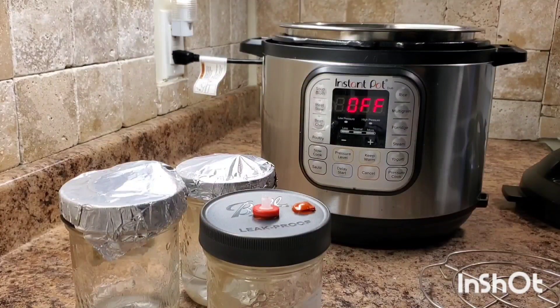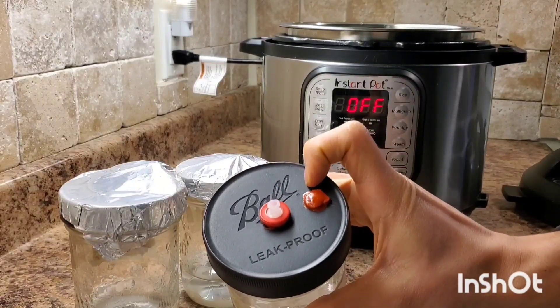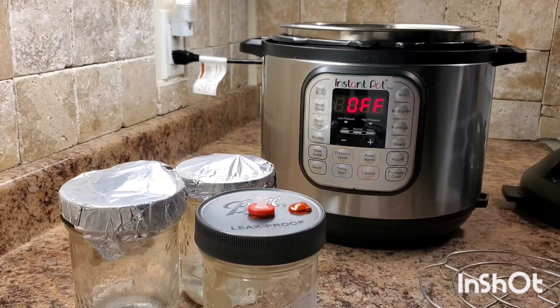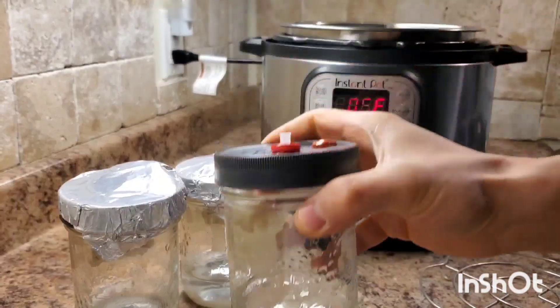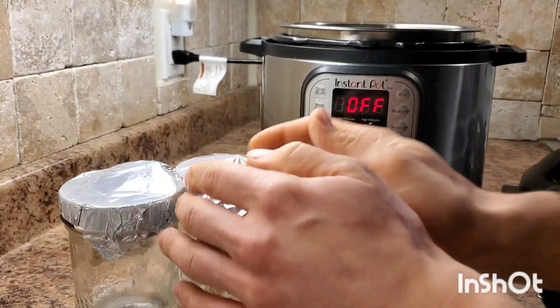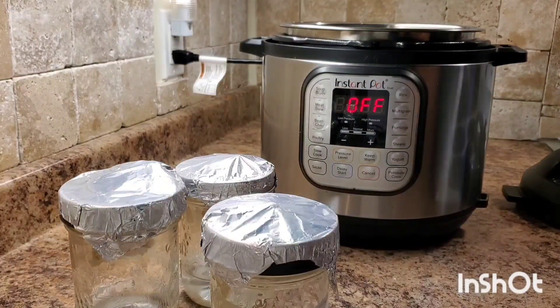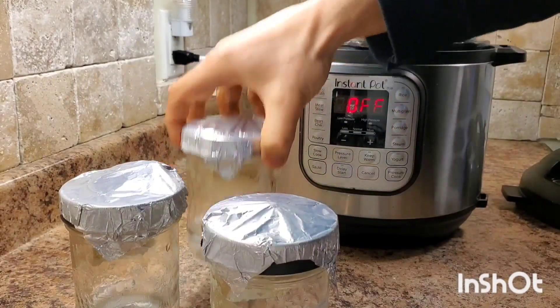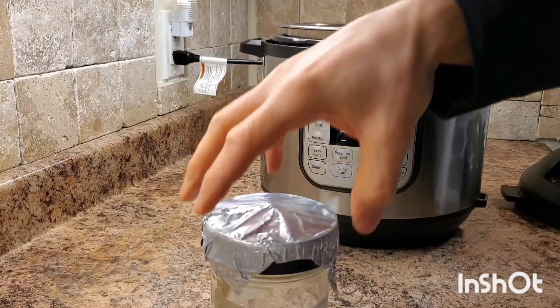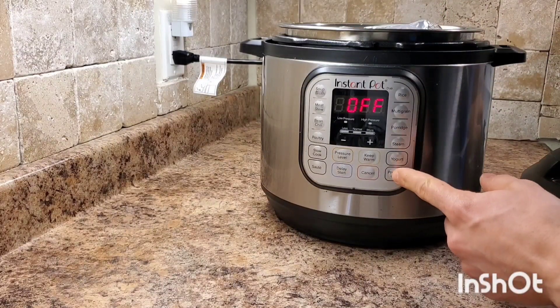We have all three of our jars prepped and ready to go. We have the lids on with the air port and the injection port so that when everything's nice and sterile we can use that easily. We have our magnetic stir bar in place — you could also use a piece of broken glass or a marble. We're going to place the rack or trivet inside the pot, and I've also put about 700 milliliters of water in. We're going to stack our jars inside and pressure cook.